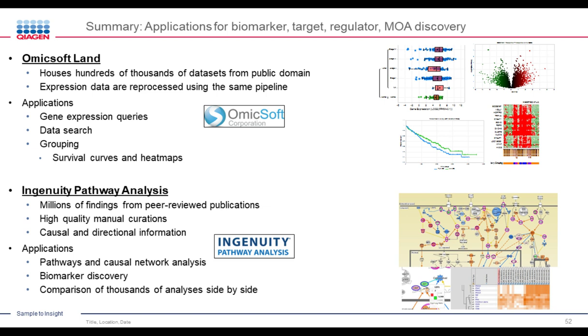Now, Dr. Mistry, our last question. Is the curated information or data QC'd? Yes, absolutely. So in terms of Oncoland database, it is QC'd at multiple places. So even before we decide to bring data in, we have QC process. Once the reads are mapped to the reference, there's QC process in terms of how many reads are mapped versus how many reads are not mapped. There's also QC in terms of metadata curation.